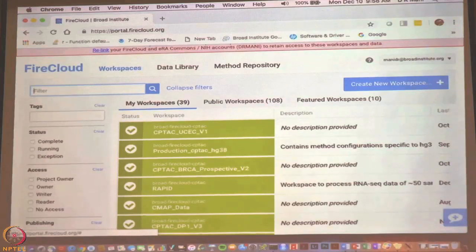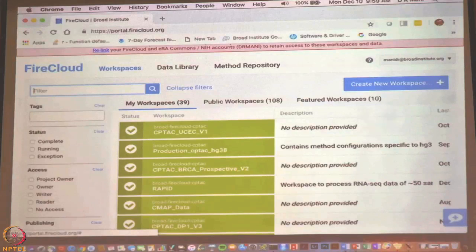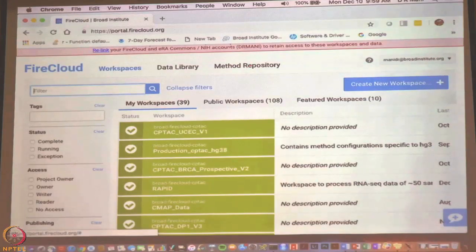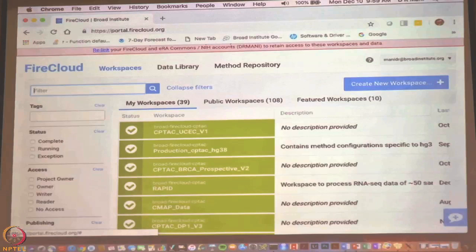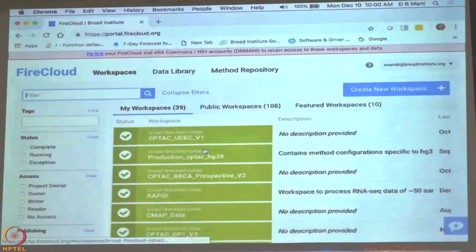The CPTAC data is available, the genomics TCGA data is available — all those data are available in the data library and you can use it for your analysis, look at it, or download it, though downloading requires an account because it costs money. Then finally there is the method repository, which has methods that everybody has written. Some methods are public, some are shared where the method author gives you permission to look at it, and some are private — only the authors can see. Whoever writes the method can control the access privileges. If it is a method you are still testing, you would keep it private, then share it with your group, and ultimately when your paper is released you make it public.